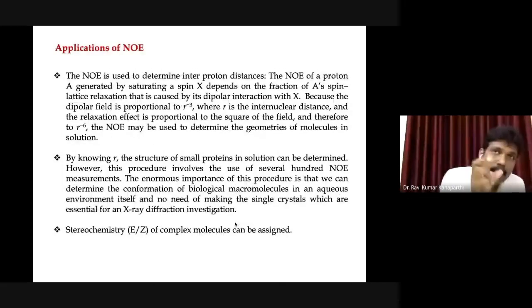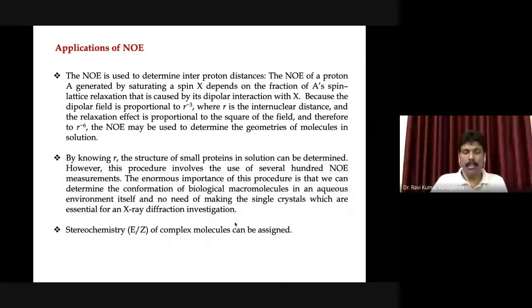So this is a very useful tool for 2D NMR spectroscopy. They use this information and store it. It's not one type of experiment that they do to solve the 2D NMR spectrum of a protein or any other molecule; several other experiments of this kind are done continuously and systematically to find out all the r's. Now there is through space, two things are connected: one proton, and another proton.